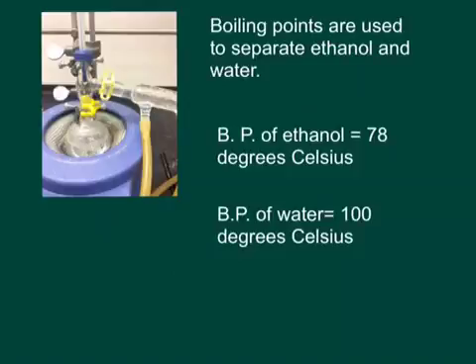Therefore, while ethanol travels up the distillation head and into the water-jacketed condenser, the ethanol begins to condense and can be collected as a distillate, whereas the water starts condensing as it reaches up the flask, and it starts to drip down as it's visible in the image above. Therefore, the water goes back into the liquid, but ethanol is able to travel out and be collected at the end.